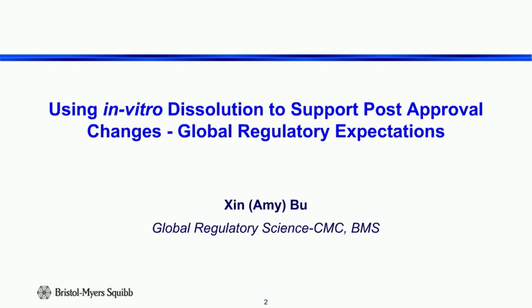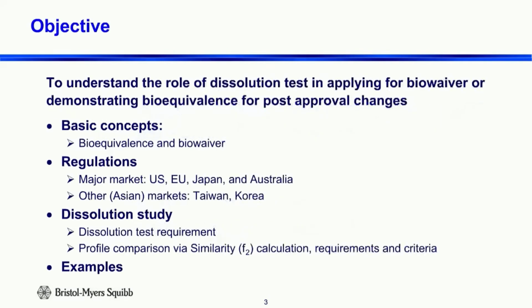So in today's webinar, I'll focus on the understanding of the role of dissolution tests in applying for Biowaiver or demonstrating bioequivalence for post-approval changes. So I'll start with introducing some basic concepts in terms of Biowaiver and bioequivalency.